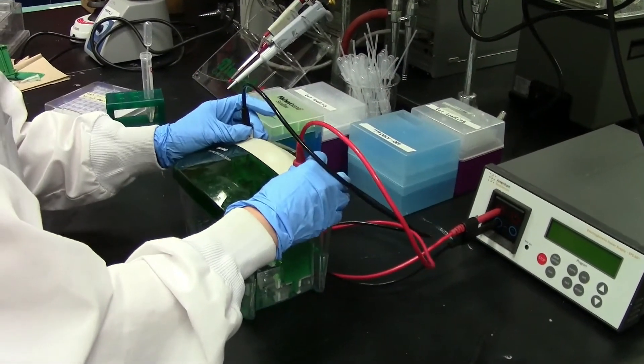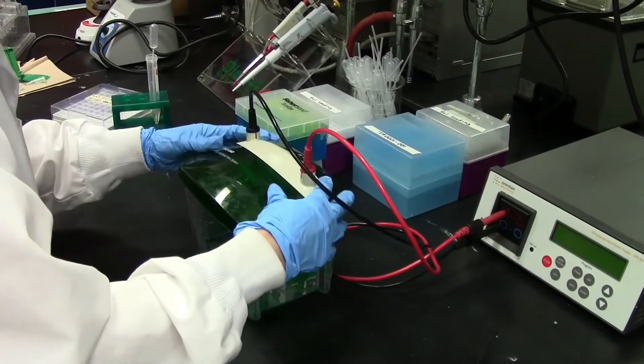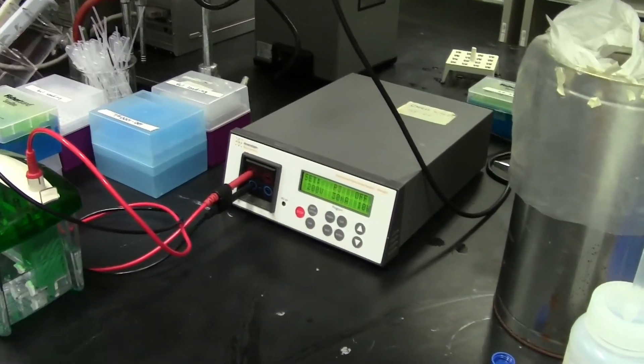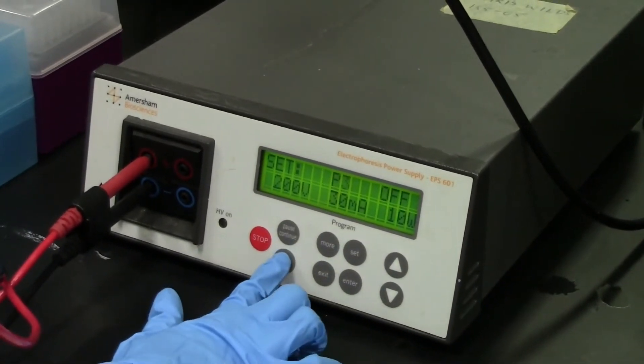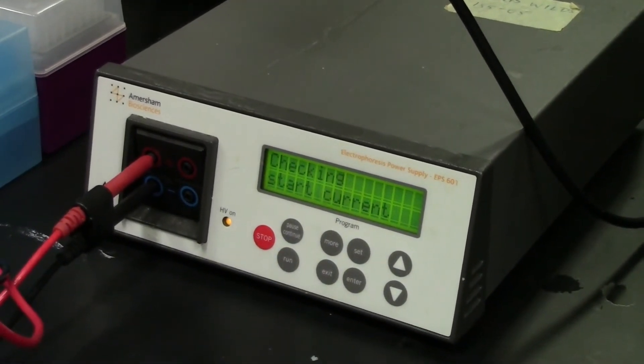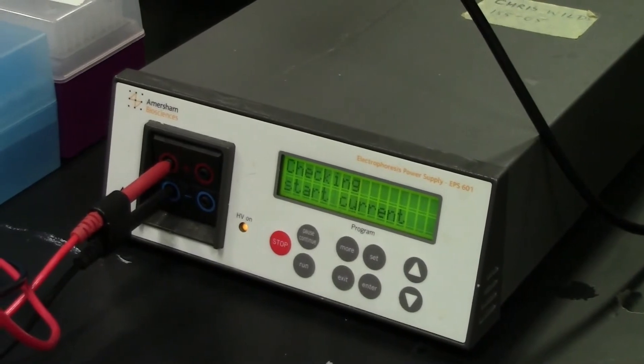Now you are ready to turn on the power supply to apply an electric field. Place the lid on the buffer tank ensuring that the black and red electrodes are aligned appropriately. You can now turn on the electrophoresis power supply. Set it to 200 volts and press run.